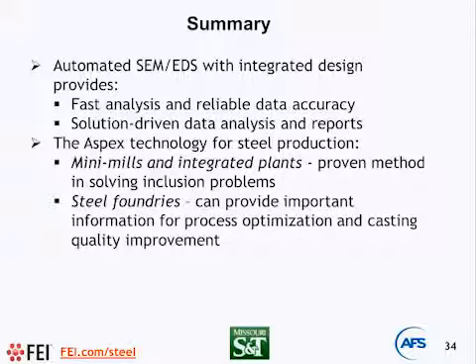So when we use the so-called soft quenching technique, we collect a sample from the melt, and soft quench allows us to have very small graphite inclusions, and then we apply automatic inclusion analysis to analyze what will be the nuclei inside. And we found something very interesting: the average composition of inclusions inside the nuclei, inside the graphite. This was a key important factor to develop a new inoculant, because we definitely know which inclusions are inside graphite or which could be outside in the metal matrix. So there could be different types of interesting applications for ductile iron production.